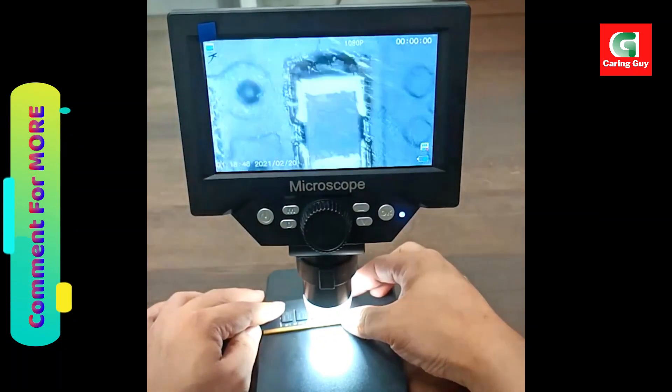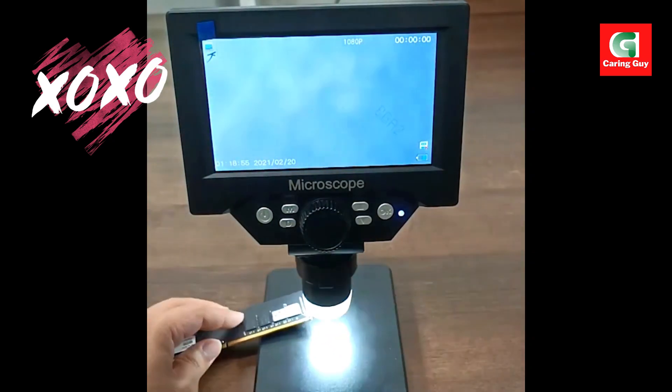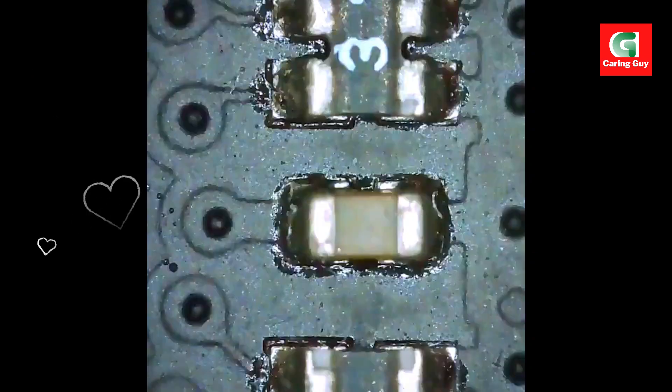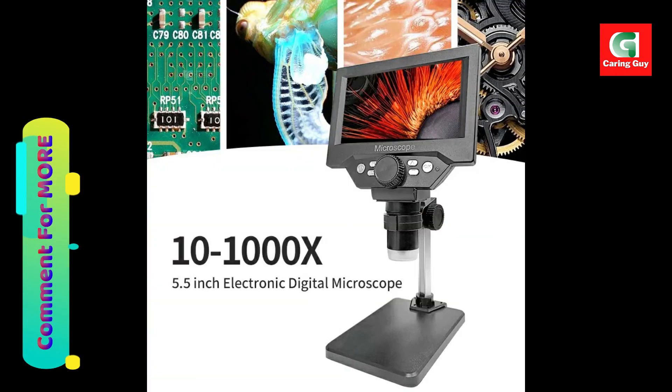Wide application: this USB microscope finds utility in at least six fields, including coin collection, PCB inspection, outdoor observation, and more. Its durable base adds stability, making it suitable for diverse applications.